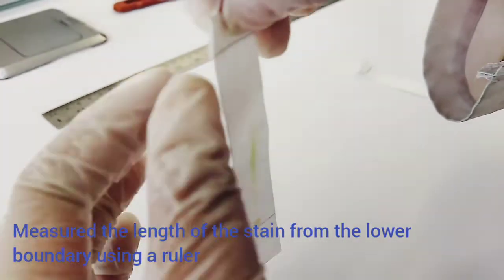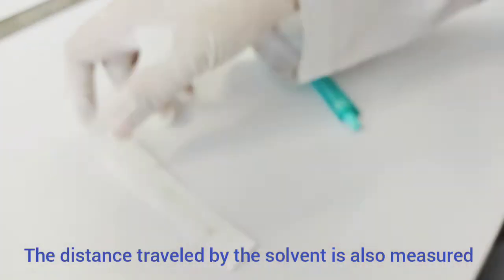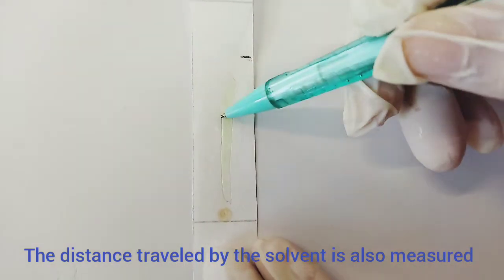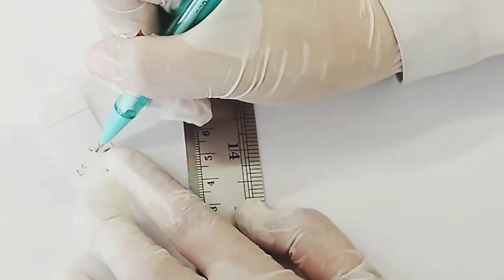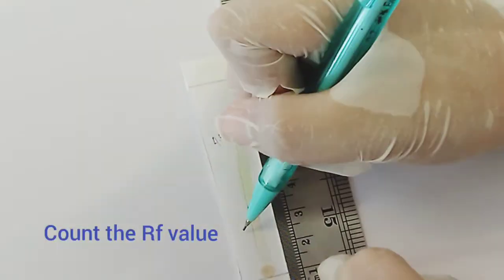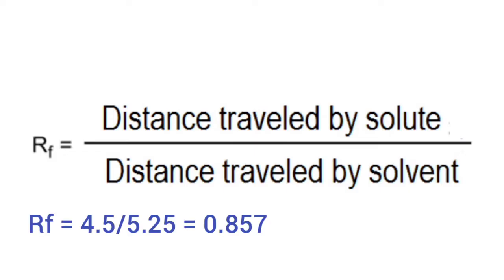Measure the length of the stain from the lower boundary using a ruler. The distance traveled by the solvent is also measured. 4.5 is the distance traveled by the solute and 5.25 is the distance traveled by the solvent, so we get the RF value of 0.857.